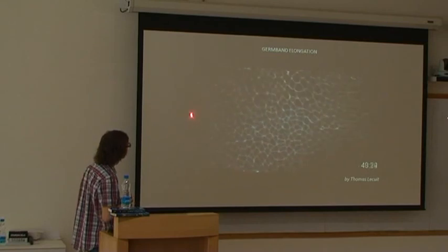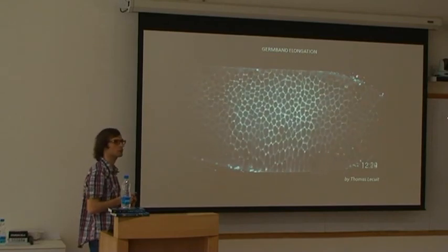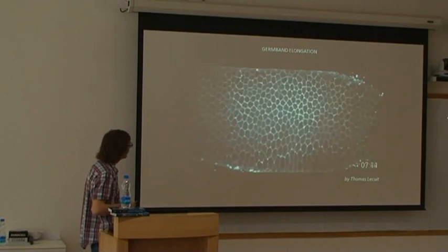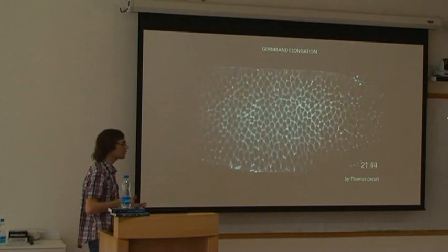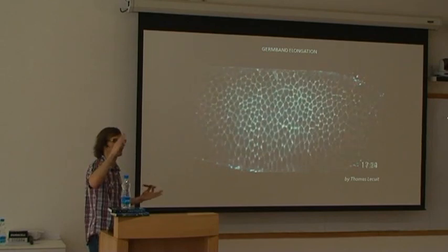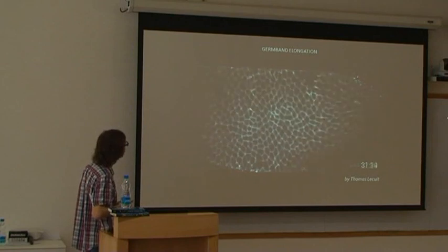And these cells at the apical surface, which is the one that you're looking at, they have adherens junctions. And this is what you see, because this is something marking epithelial adherens junctions. It's not written, but this is what it is. So this work has been done by simplifying this tissue in a 2D tissue, as you see it now. So we forgot completely that, in fact, these cells have a 3D shape. So this is some kind of a simplification.